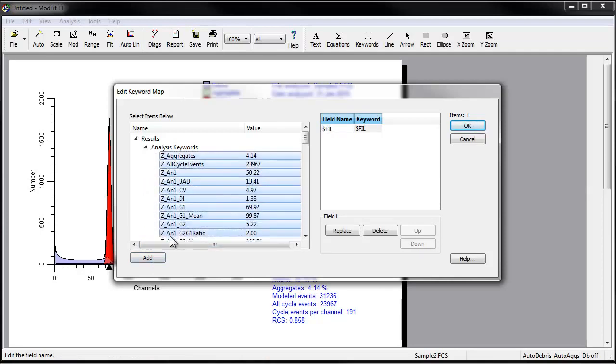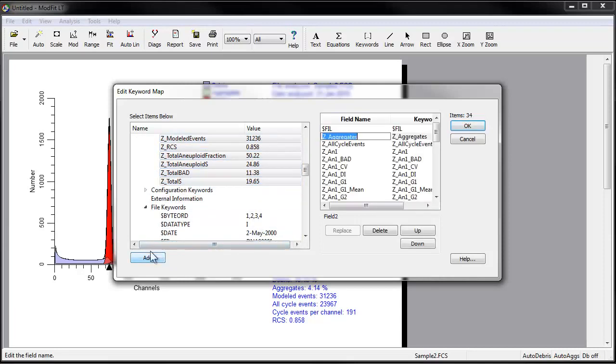You can edit the selected field names after they are added. Click the field name once to select it, allowing you to type a new field name for the field. You can also use the Tab key to move from one field to the next if you need to edit the names of several fields.